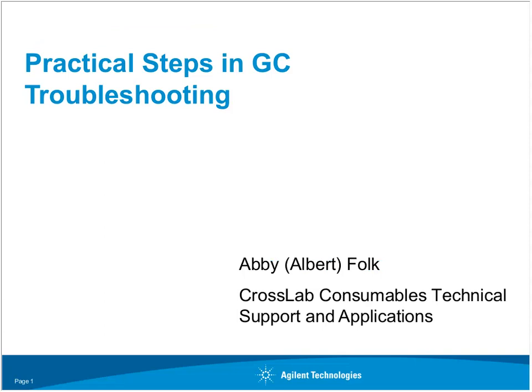Today's presentation, practical steps in GC troubleshooting, we're going to cover a lot of details. We're going to cover different ways to identify problems with chromatography. We're going to look at different examples of what poor chromatography might look like, and we're actually going to go into some really good troubleshooting, so how you can go in and work through those problems using some techniques that I'll share with you.